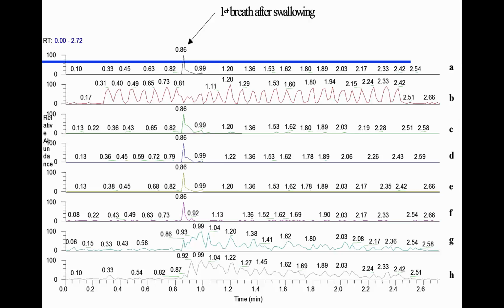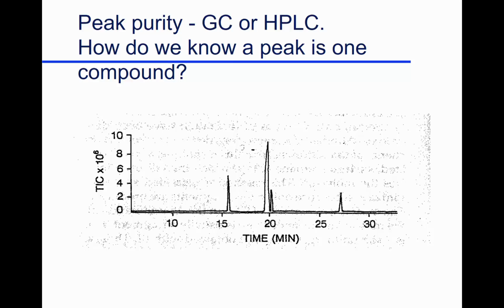So what the mass spectrometer said is, boy, you got a big shot of this aroma chemical. That's what was given up here. That's a different aroma chemical. So these 3, 4 chemicals are really quite volatile. They really want to get rid of it. And then here, some of the heavier, less volatile chemicals. They weren't hardly sensed at all in that swallow breath, but they built up over time. So it's kind of a temporal profile, a difference in how flavor chemicals are released and how they're sensed. It's a rather neat technique that helps you understand what you were given and how that relates to perception of the food. So that mass spectrometer is a pretty neat little tool.